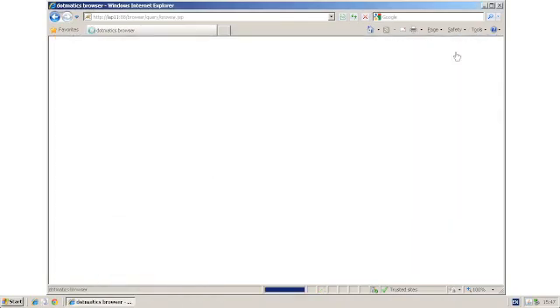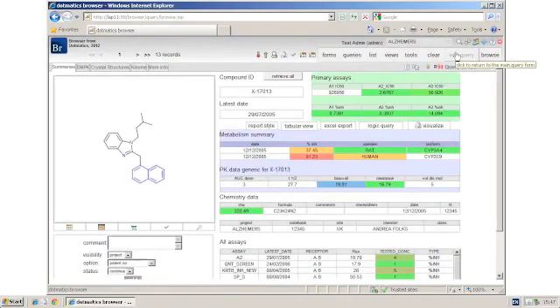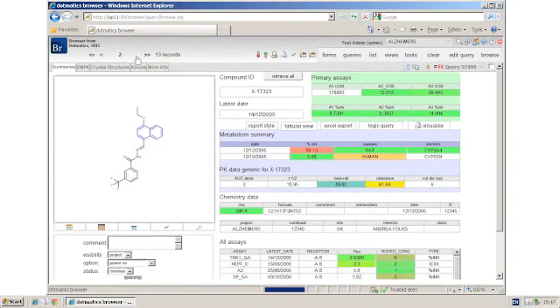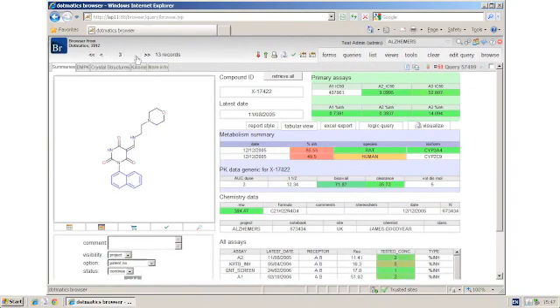This will retrieve a list of compounds that meet those query criteria. I can step through these compounds one record at a time.